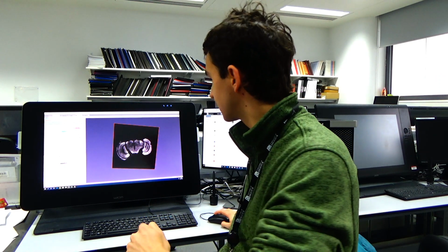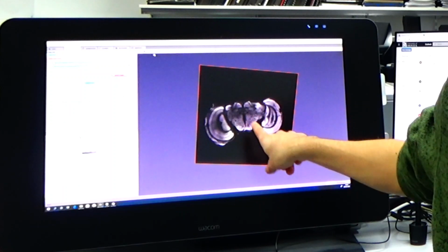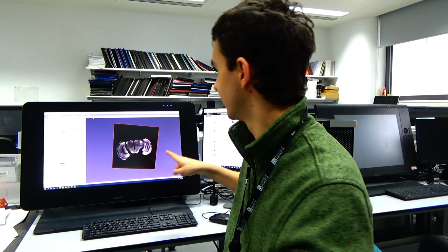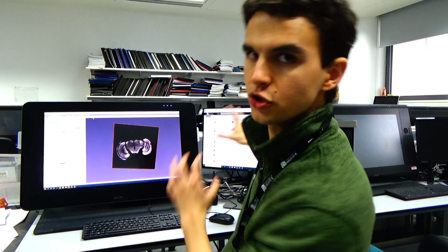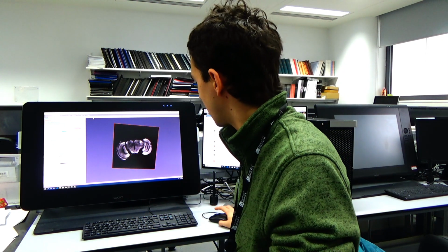And here in this imaging lab, that's where I start to look at that a little bit. So what you're looking at here is a butterfly brain. You see, to understand what sensory information a butterfly is taking in from the world, you could do a lot worse really than looking at the brain, because inside the brain there are different regions, we call them different neuropils, that encode different information. They process different types of information.